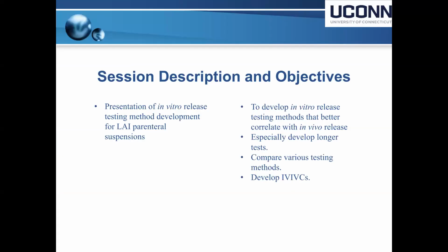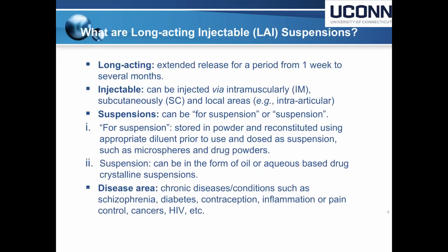So the session today, as I said, will be mainly on the in vitro release testing method for the LAI parenteral suspensions. And our objectives were to develop in vitro release tests that would better correlate with in vivo release. In particular, we wanted to establish longer tests than what are currently available. We were going to compare some different testing methods and then hopefully develop the IVIVCs.